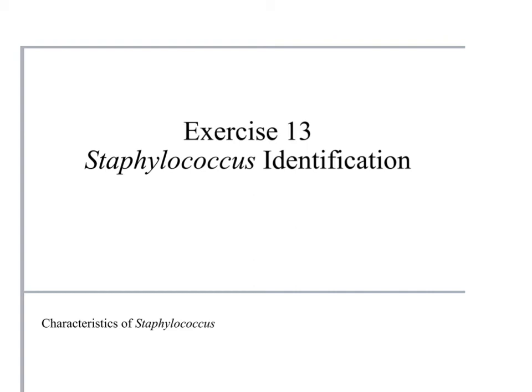Exercise 13 is an important one because this begins the material that you are going to need to really master in order to do your unknown in just a few weeks from now. So it's really important to not only understand the tests that you're doing, but also to be looking around at people around you and see how their organisms look different than yours. I'll try to highlight places where that becomes really critically important.